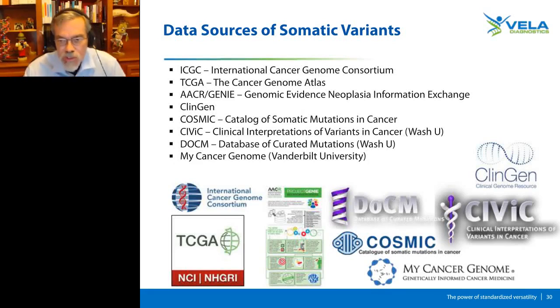Once we have filtered the germline variants from the somatic variants, we now have a list that should be considered cancer-specific somatic variants. This list is usually long, and most of the variants are passenger mutations. In other words, they're along for the ride and don't contribute to any pathology. As such, these variants are not druggable nor actionable, in that they contribute nothing to the overall survival of the tumor. The TCGA, the Cancer Genome Atlas, is a project from the NCI-NHGRI that has completed its work but is still releasing data in the form of papers and database submissions.